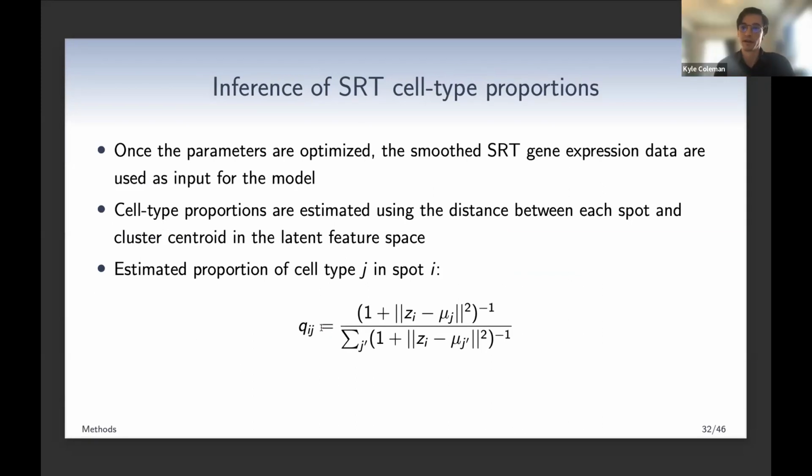Yeah, so it can be any publicly available scRNA-seq data set. It's definitely ideal if it's from a paired sample, but that's not very common. Only one of the data sets that I analyzed actually used a paired scRNA-seq data set.